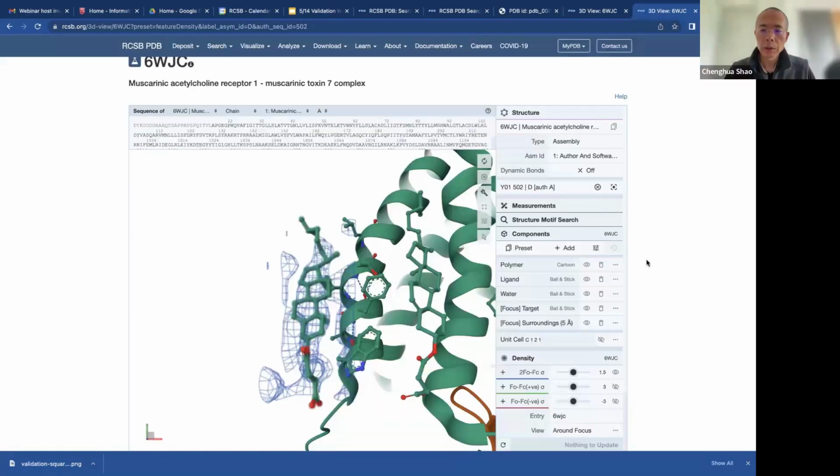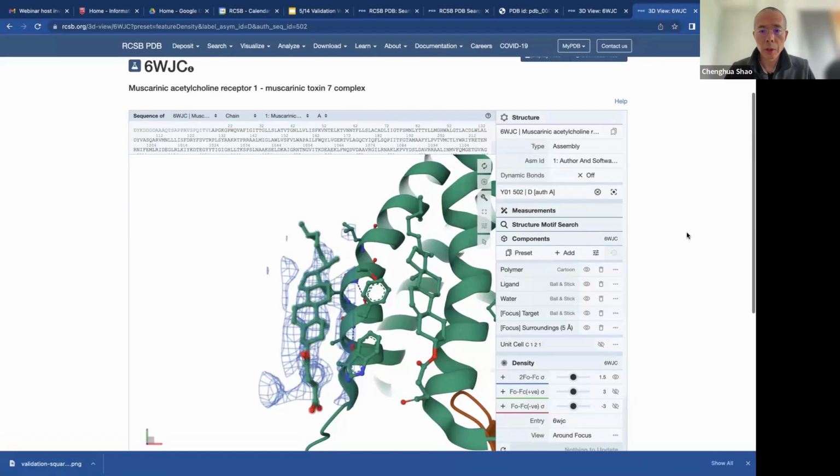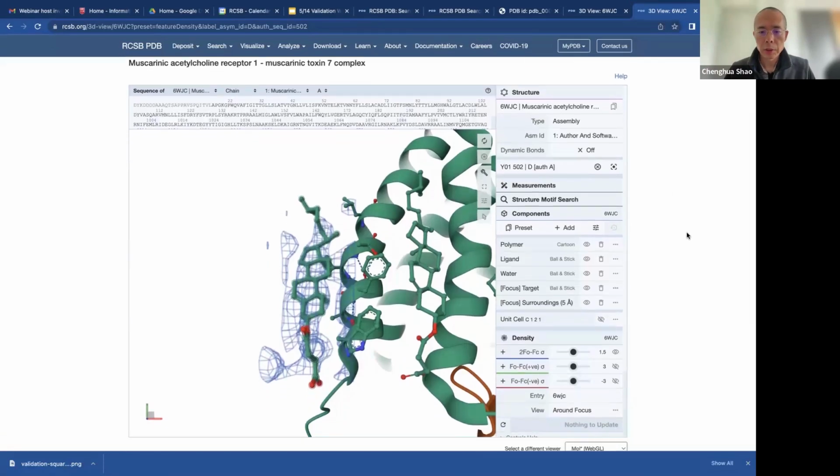Yes, and I think this Mol* viewer introduced some of these features for your research. It does have many other features I didn't introduce today. And in June, there is an event run by Shuqi that helps you understand how to use Mol* if you register for it.